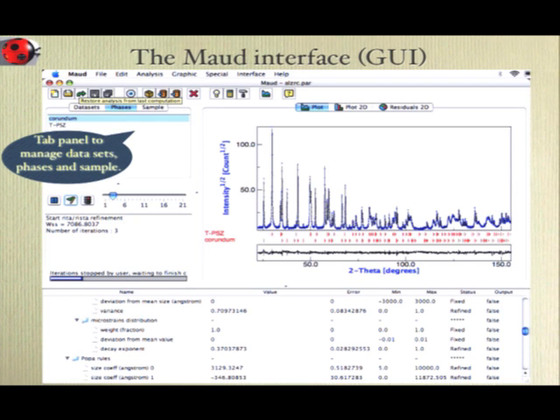So you can then put several instruments in it. If you have a neutron instrument and an X-ray instrument, you have two data sets and you put the data in them. You add a new data set every time the instrument has a changing setup in which, for example, the instrumental broadening is changing, okay, or something else.